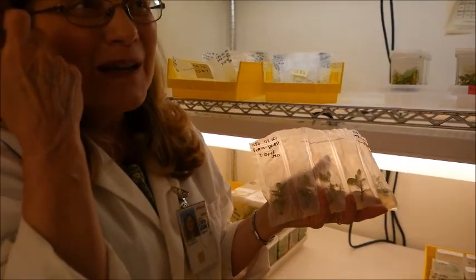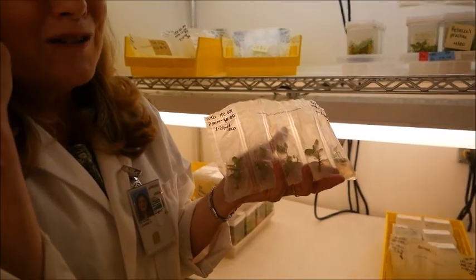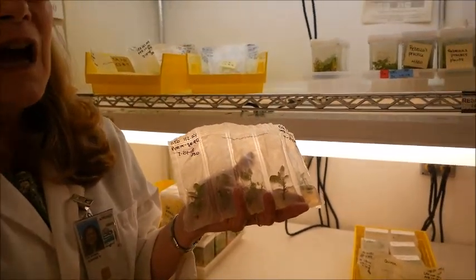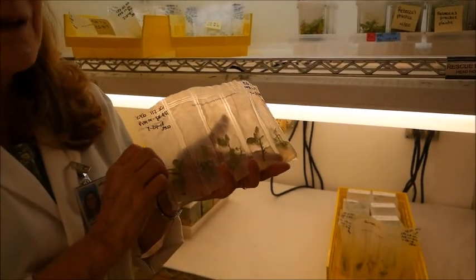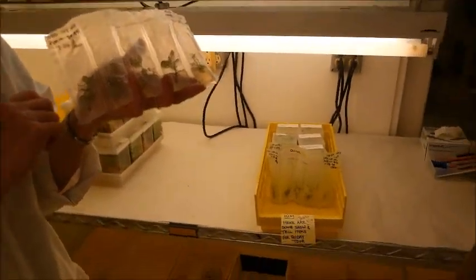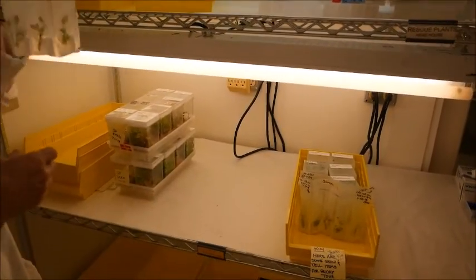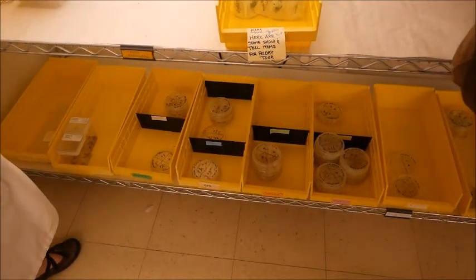You've got to trick them — trick them into thinking winter's coming. When they've had that week of minus-one-degree long nights and cold, then we put them in the walk-in cooler with a low level of light for a short 12-hour day, 12-hour night cycle, with a little bit of nutrient, and I just monitor them. They need a certain period of time in dormancy to be able to flower.